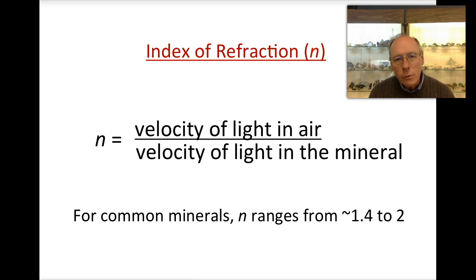It's called an index of refraction because when light passes from one medium with a particular n into a medium with a different n, the light is bent or refracted. If you've ever been fishing and stuck your fishing pole in the water, you've probably seen this because your fishing pole looks like it's bent.